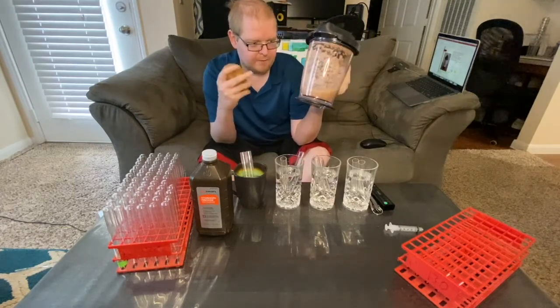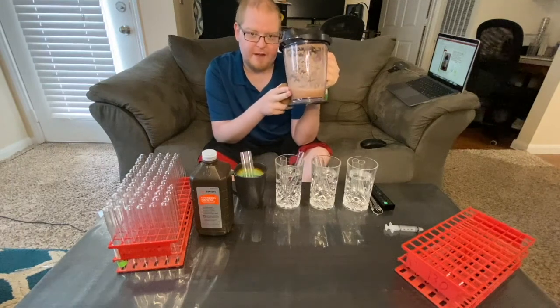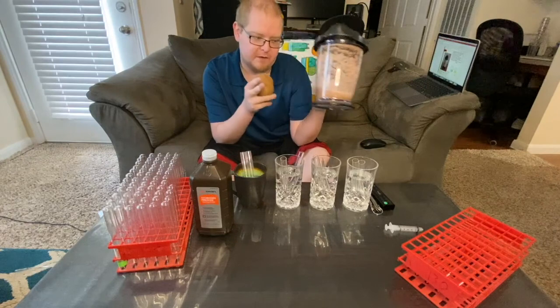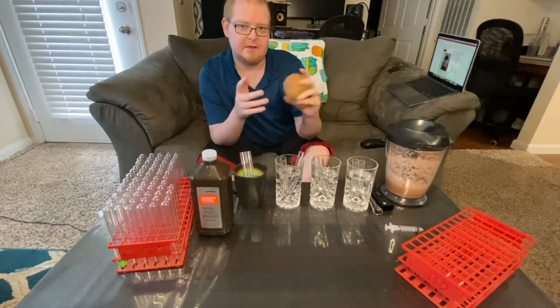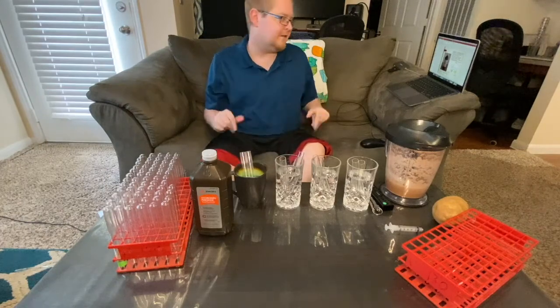So all of this in here is basically starch, plant cells, and a lot of enzymes. And one of those enzymes is catalase. There's a lot of dirt on that potato.